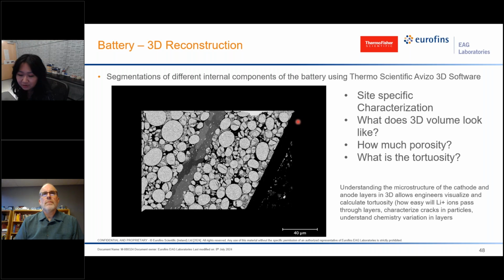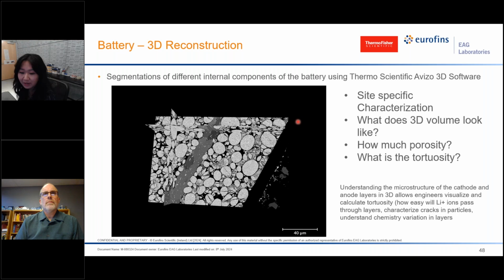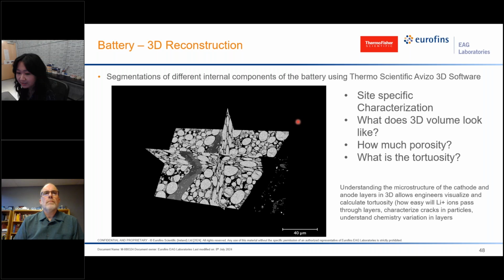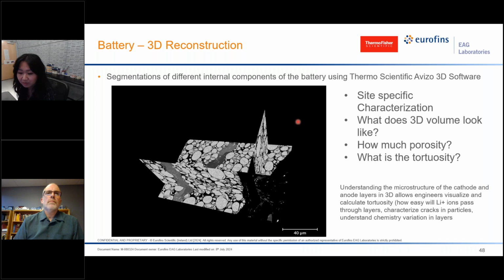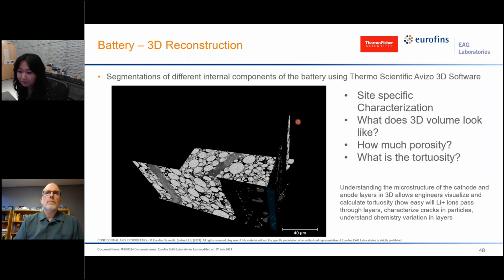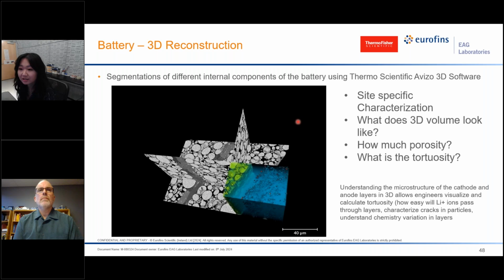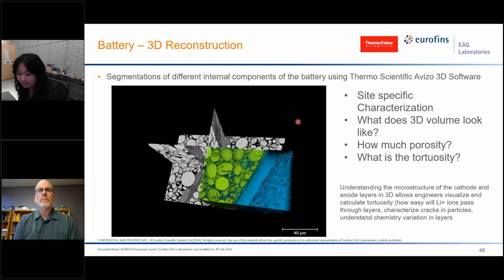With Plasma FIB, we can also perform a 3D reconstruction, which I mentioned earlier in the through silicon via example. But similarly, for any type of sample, including battery samples, we can remove a small amount of material with FIB and take an SEM image and do that sequentially to create a stack of images and reconstruct a 3D volume. So from this, you can get particle statistics such as the average diameter, and the porosity and tortuosity, or how connected the pores are. So this is information that you could not extract from a single 2D image, and you'd really need this type of 3D reconstruction to understand.